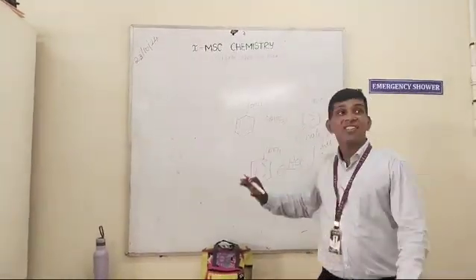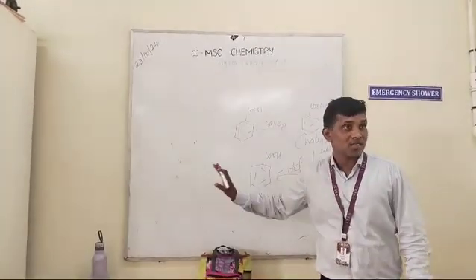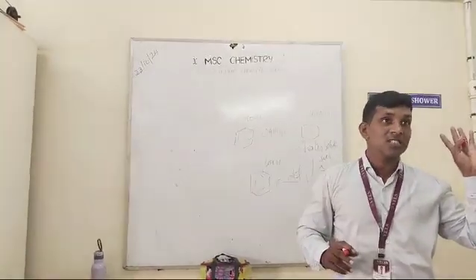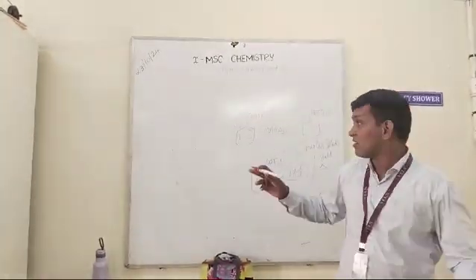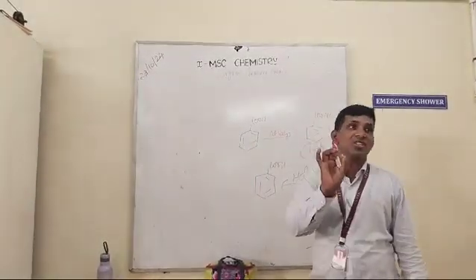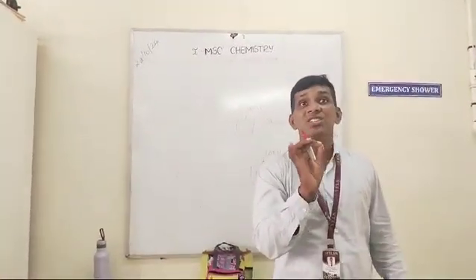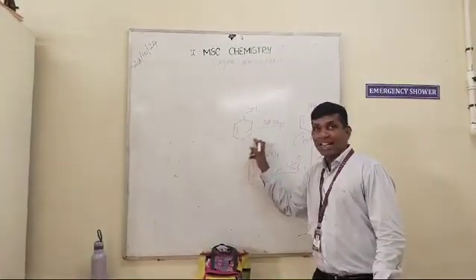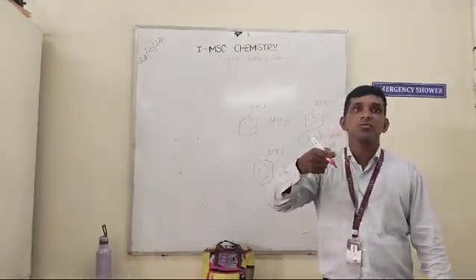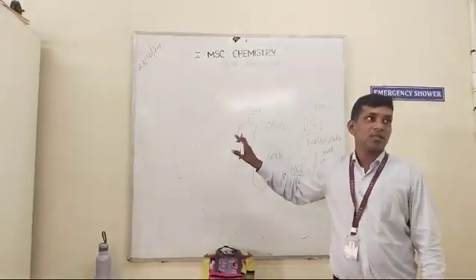This itself gives the clue that there may be the presence of carboxylic acid. Okay, fine. Then you have to do the confirmation test for carboxylic acid. These things you did in your lower classes. What are the confirmation tests for carboxylic acid? Esterification. Take this acid, add ethanol, add sulfuric acid, heat, and you will get a very pleasant smell. It confirms the presence of carboxylic acid.